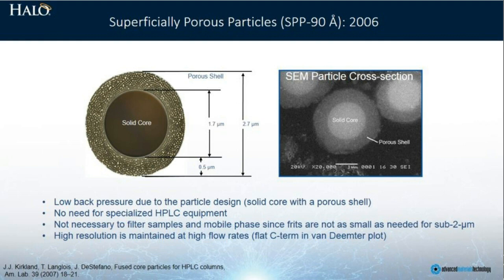Because of this, they are less prone to plugging and other sample-associated limitations that you can run into in the daily use and repetitive use of a chromatographic column.